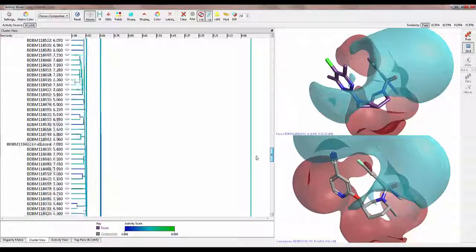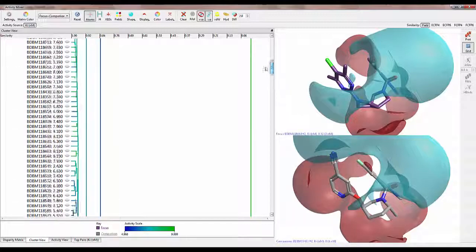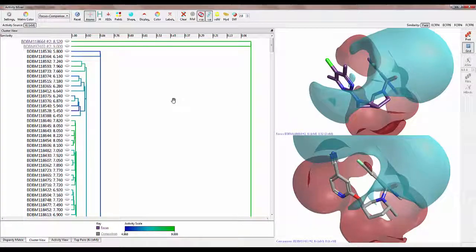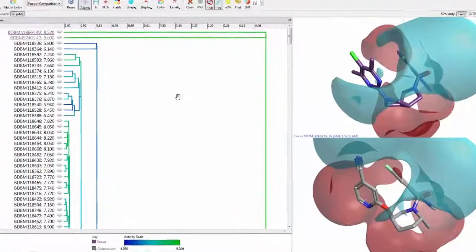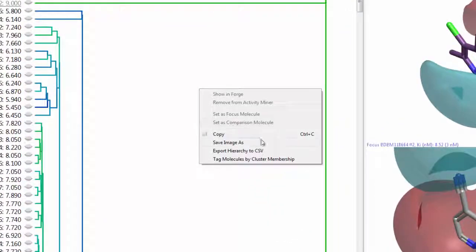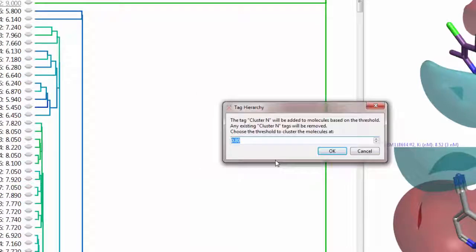By right-clicking on the cluster view, I can choose to export the cluster hierarchy to a CSV or to tag molecules by cluster membership. I will choose a threshold for the cluster groupings and press OK.